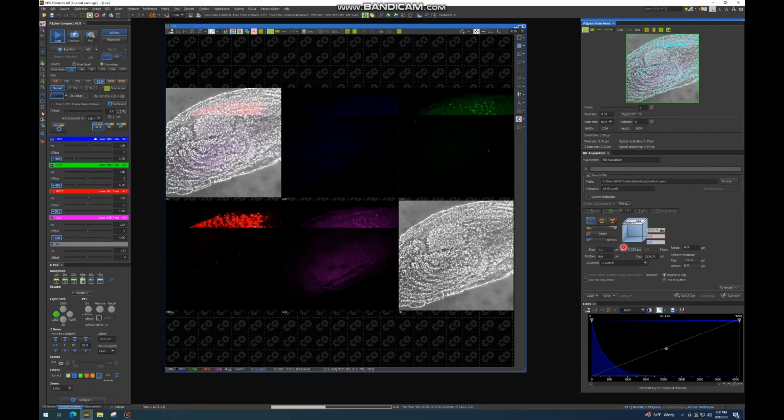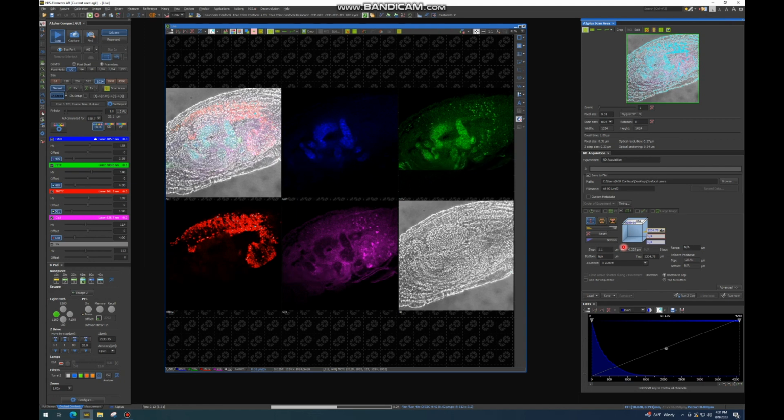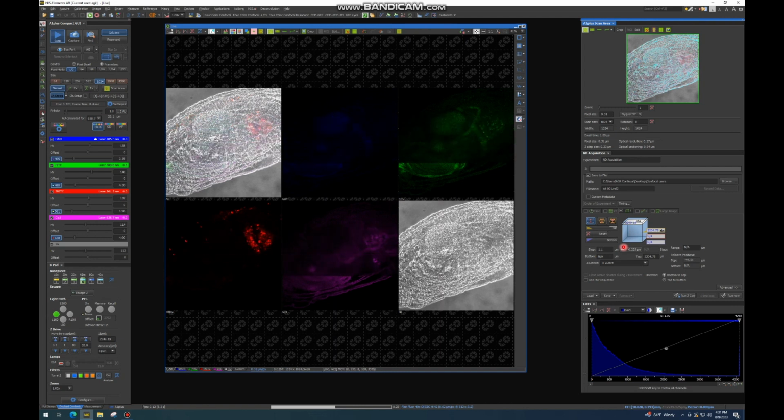And now I'm going to scroll to the bottom of my sample, and select bottom. So here I've got 42 steps.